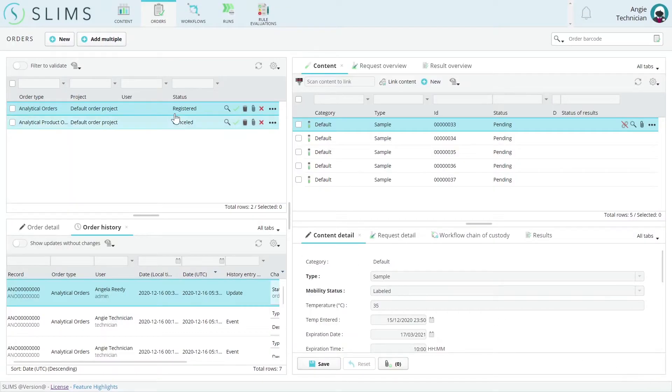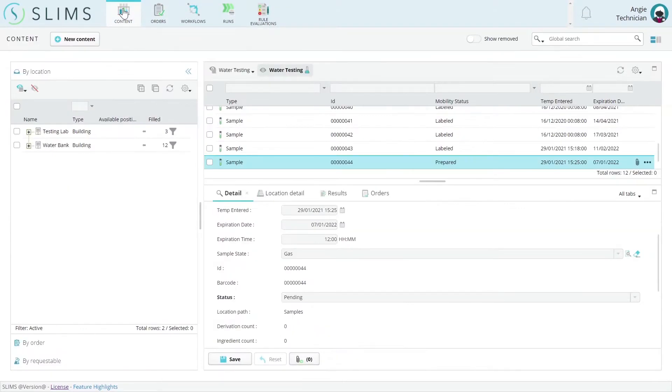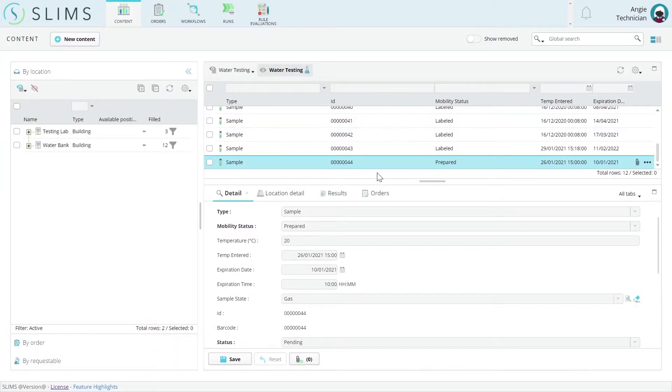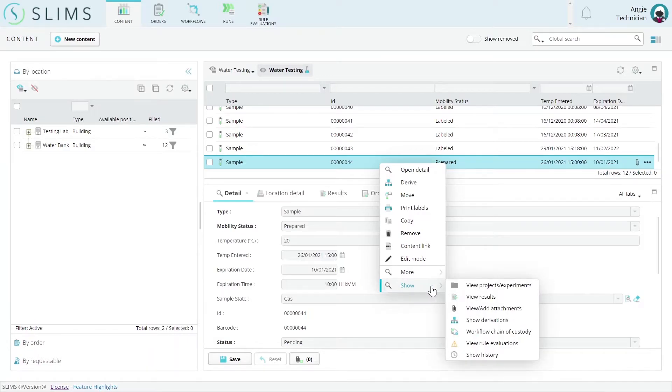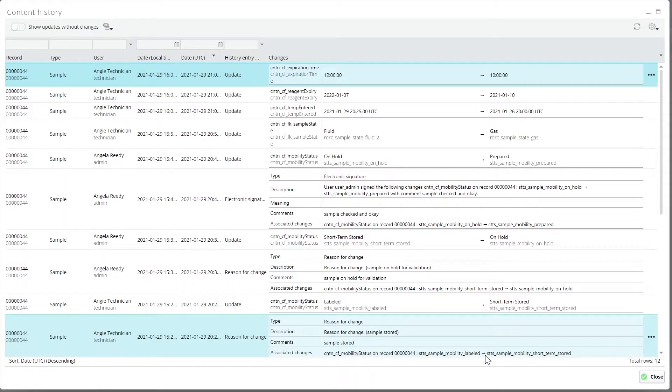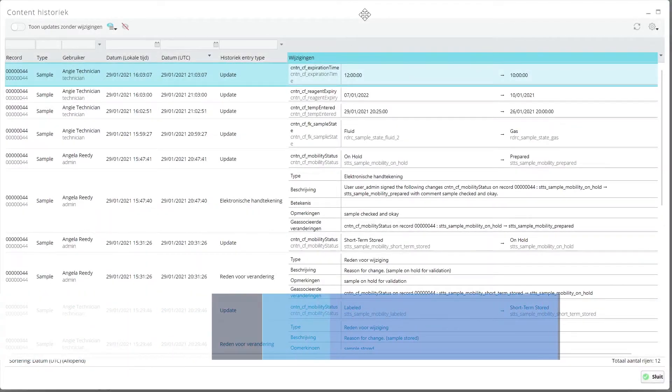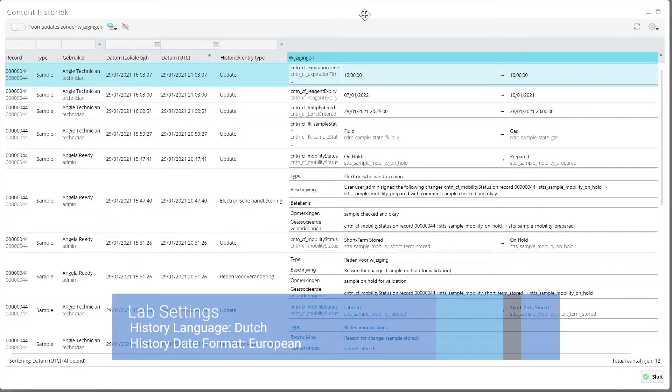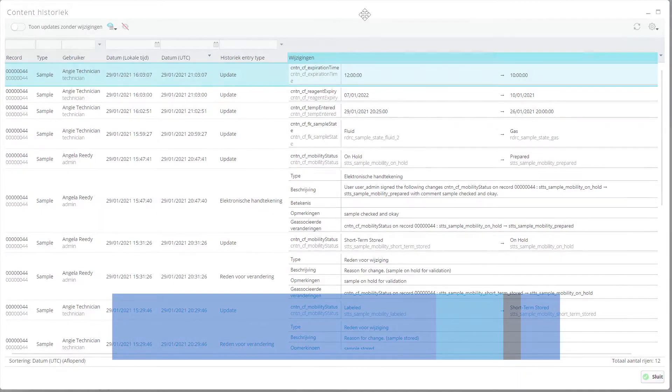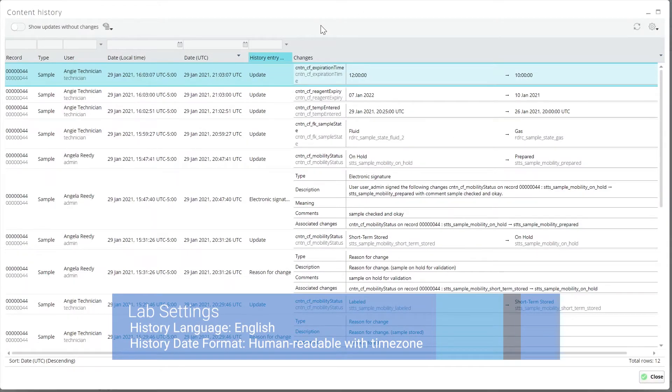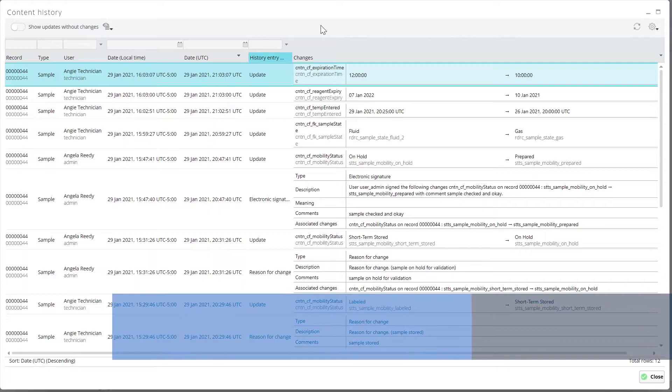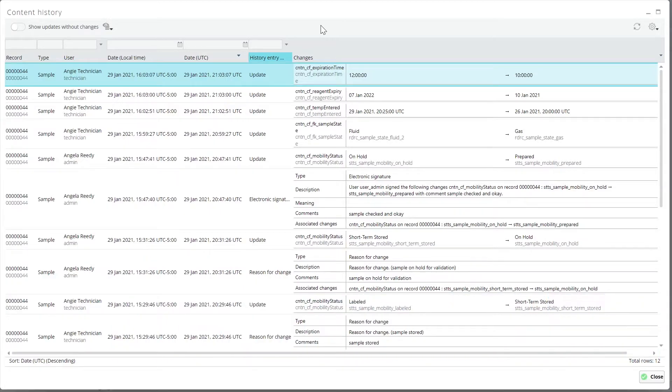Another of the most pervasive history changes involves time zones and date formatting improvements to provide a more consistent experience for users. The history language lab setting sets the language that all the instances history metadata is displayed in, regardless of the user's selected language. Additionally, the history date format lab setting will set the date and time zone format of changes in history grids.